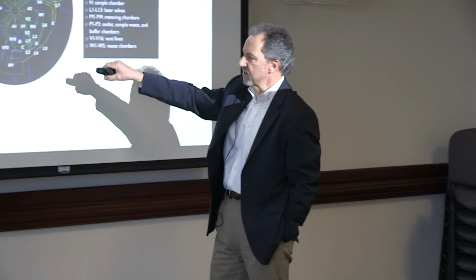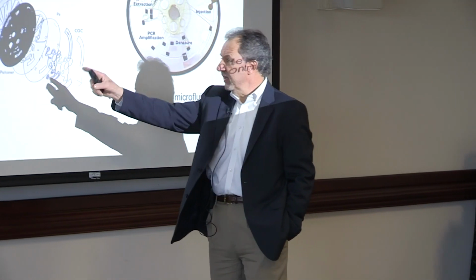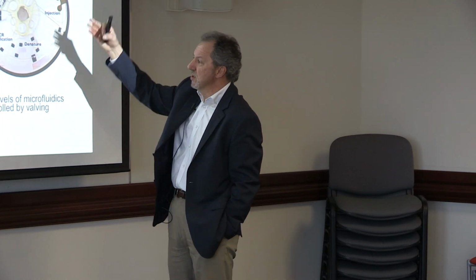And it allows you now to start working on a much more complicated device. This one has 13 valves, where now you can control which of those valves get opened at which time to carry out these processes. And I don't want to belabor the details here, but it's a relatively complicated device. It's been designed primarily by Jingyi Li, who's part of the group, who's a great design guy. And it essentially cordons off now all of the things that you need to do on this device, everything from lysing the cells and getting the DNA out, to amplifying those DNA copies that tell you something about the individual, and then doing the electrophoresis.